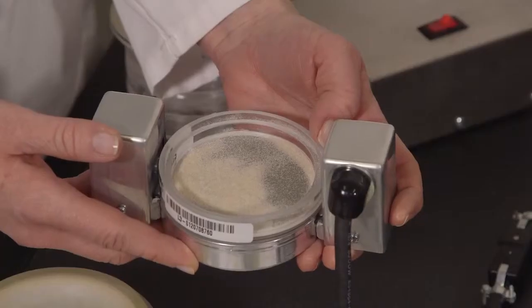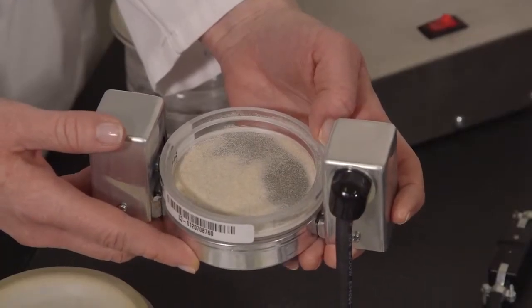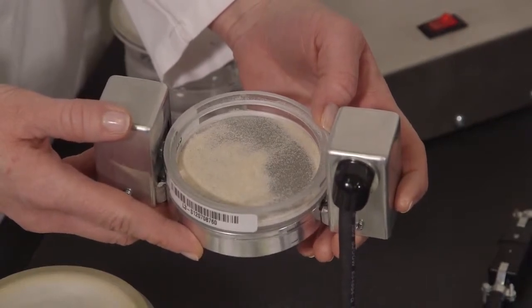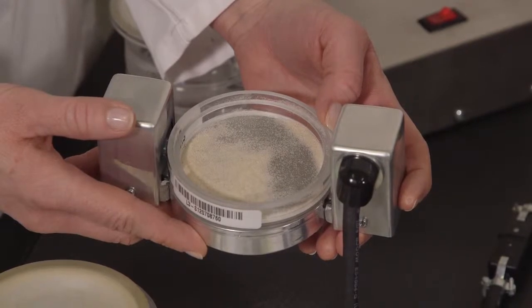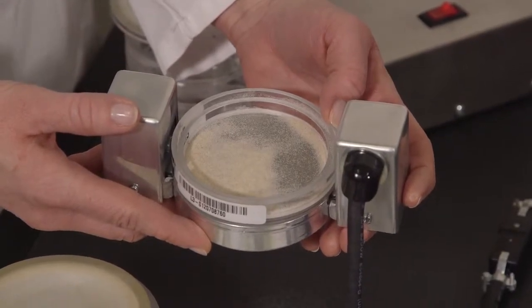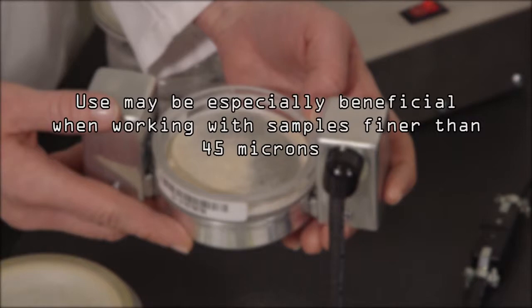By imparting a horizontal tap on alternating sides of the test stack every 4 seconds, the horizontal pulse accessory can help reduce sieve blinding and assist in breaking down sample agglomerates. Use may be especially beneficial when performing separations finer than 45 microns.